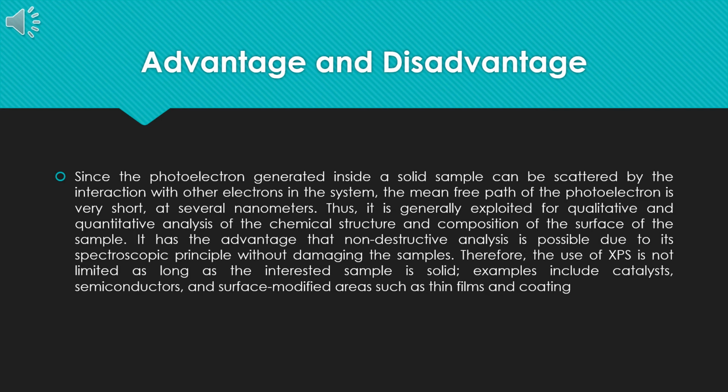XPS is widely used in both surface science, that is, the gleaning of knowledge concerning the composition and crystallography of simple, or often single crystal, surfaces and the modification of said surface in a well-controlled manner, and surface analysis, the acquisition of analytical information concerning the outer surface layers of material.